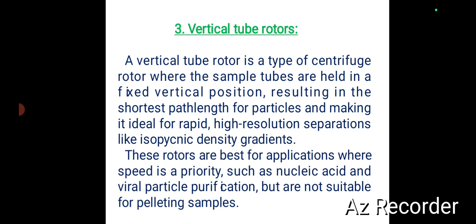These rotors are best for applications where speed is a priority, such as nucleic acid and viral particle purification, but are not suitable for pelleting samples. It is especially used for nucleic acid and viral particle separation, not for other pelleting samples.